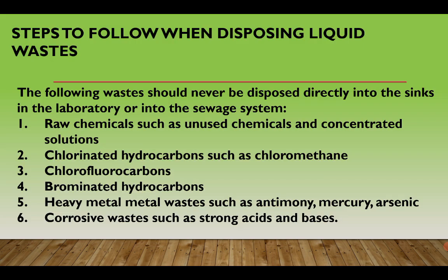All right, having discussed the safe ways to follow when disposing solids, let's look at how we can safely dispose liquid waste. Remember, a liquid is defined as anything that flows like water.